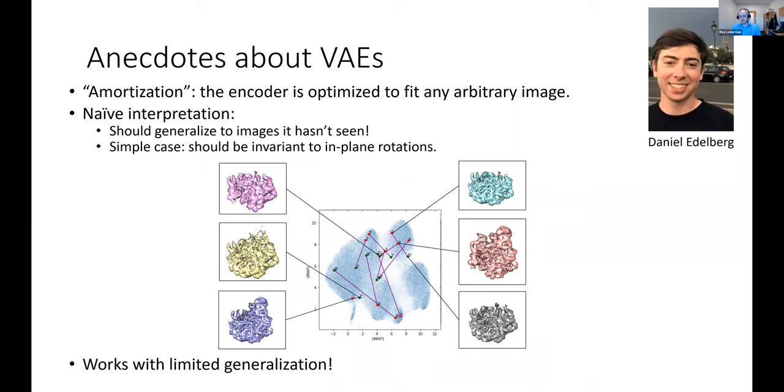You might see either, okay? So we did this very simple experiment. We trained this other encoder on images, and then we tested it on each image rotated. This is where image zero was placed in this latent space projected with UMAP. This is the tau provided for this image, and this is the tau provided for the same image rotated. They're supposed to be the same. They're not. Very often it kind of sends the image pretty far away.